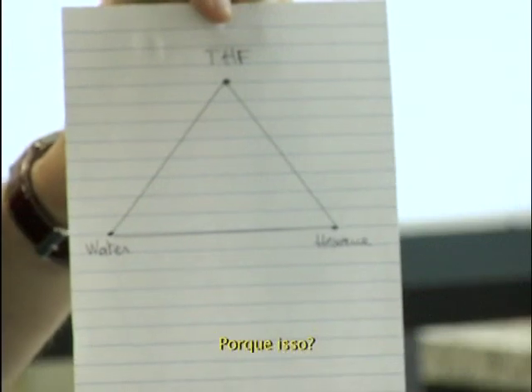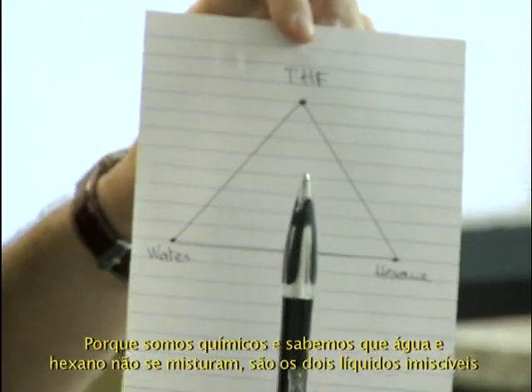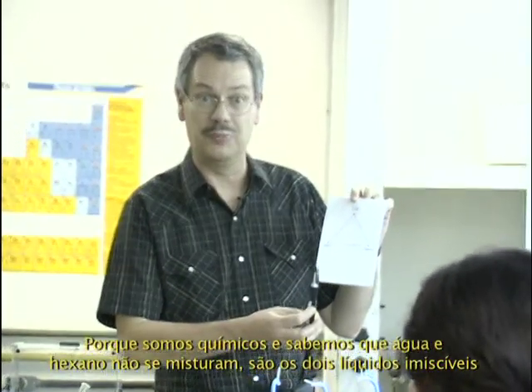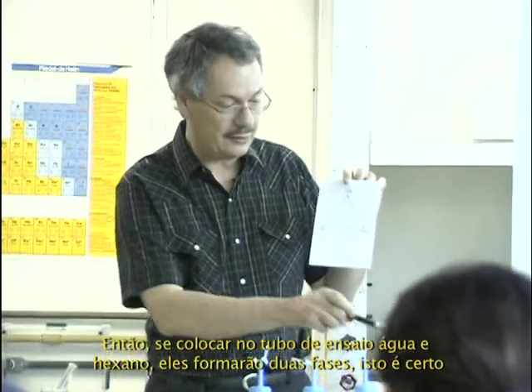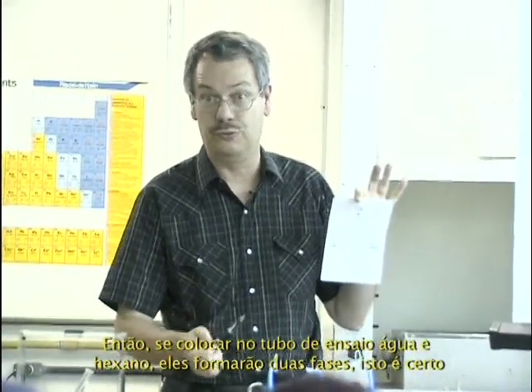Why is it so? It's because we are chemists and we know that water and hexane are not miscible. That's the two immiscible liquids. So I know if I make in a test tube hexane and water, I will get two phases.